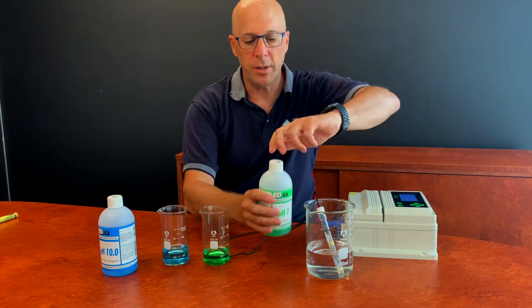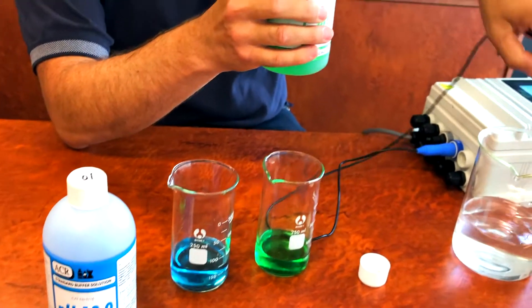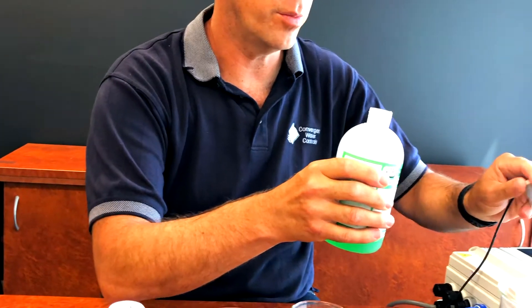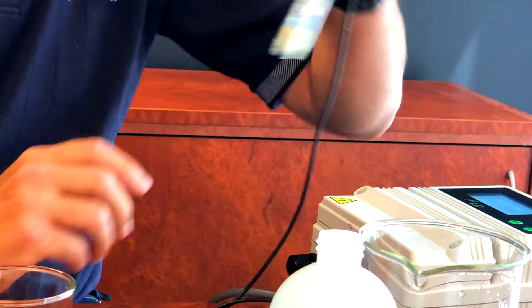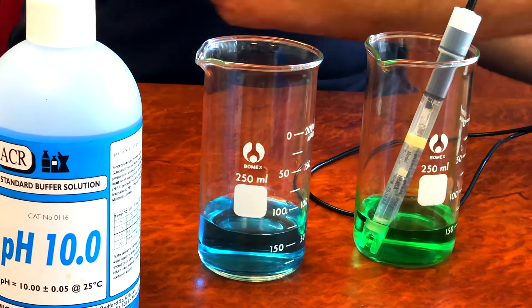The first step is to calibrate pH 7. I'm going to open the bottle and take the pH sensor out of the process. Best to give it a wipe with a tissue or paper cloth, rinse the end with a little bit of the buffer, give it a shake, and put it in the buffer solution.